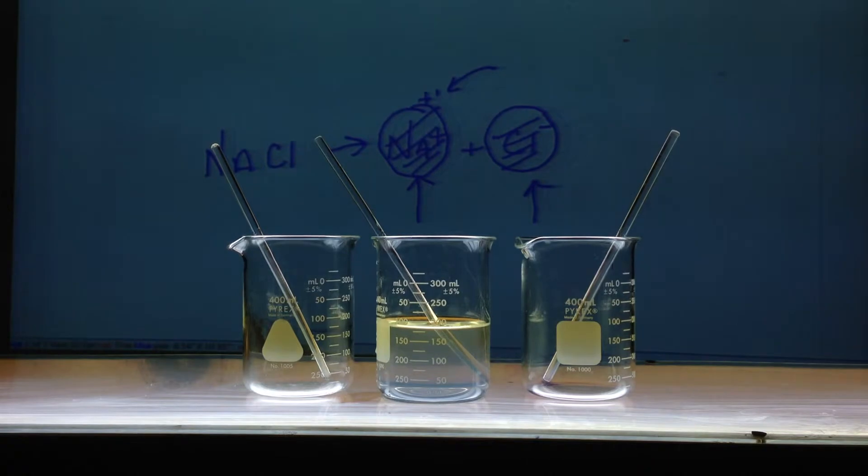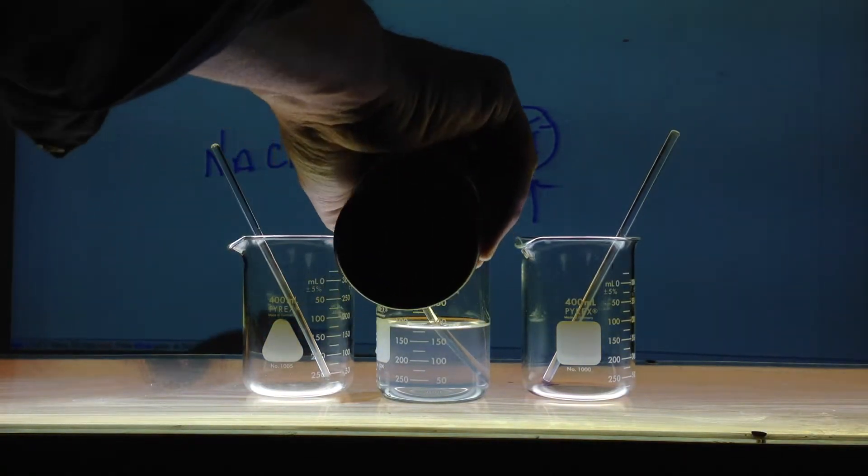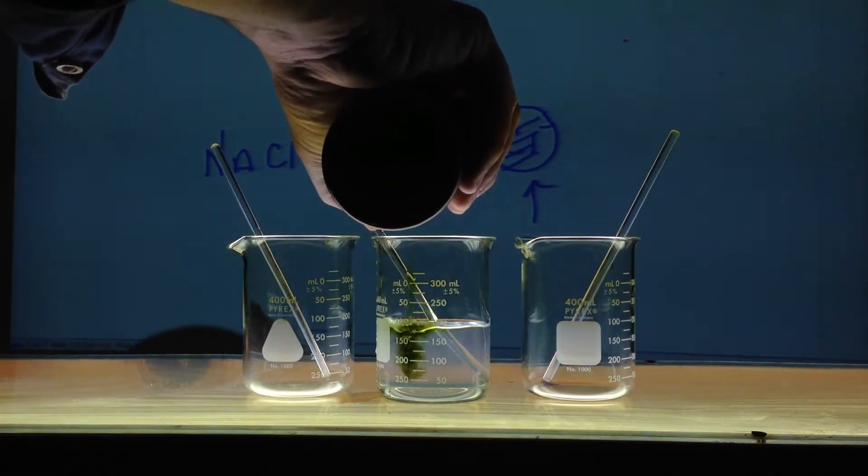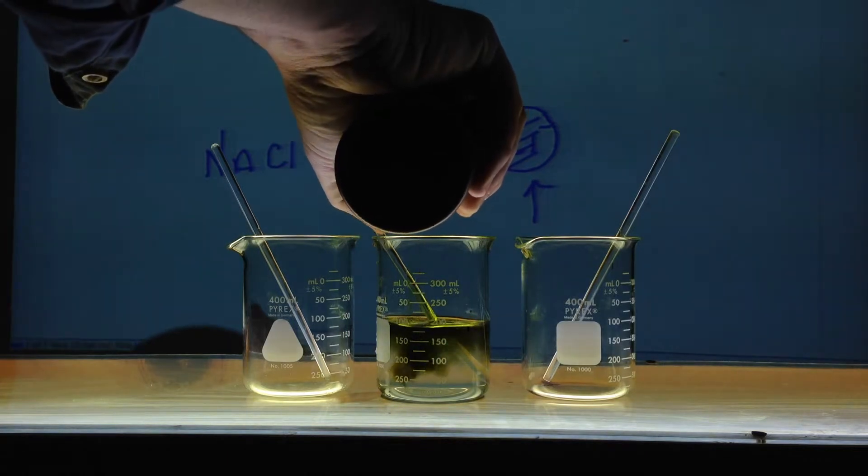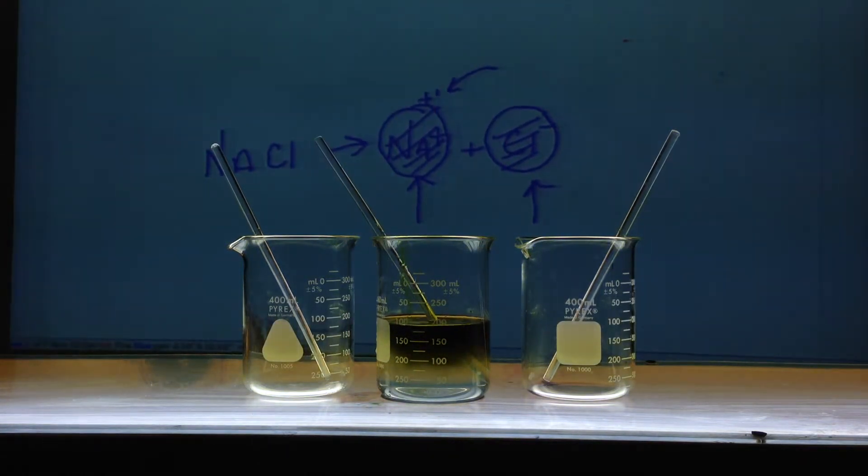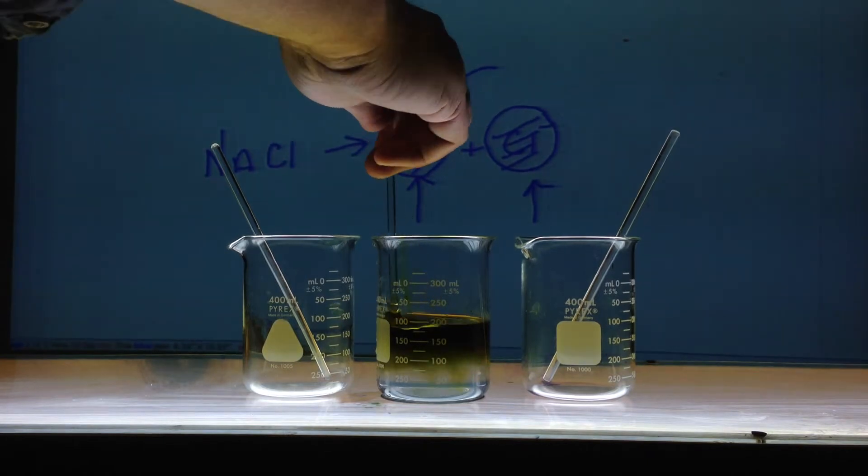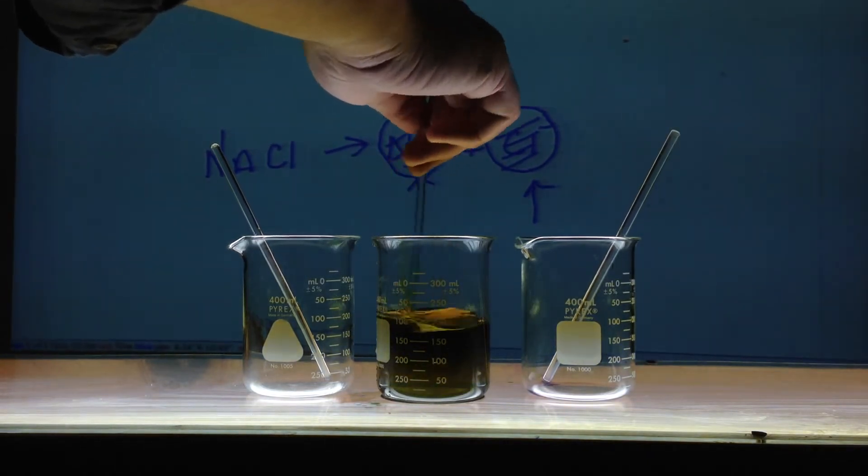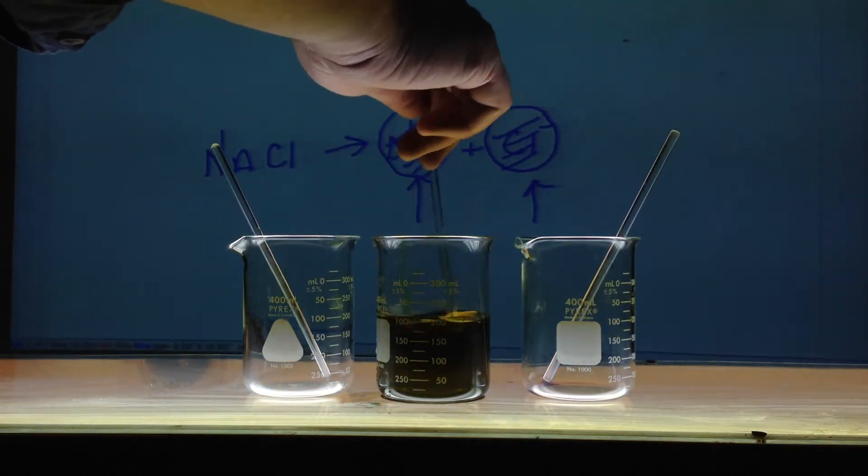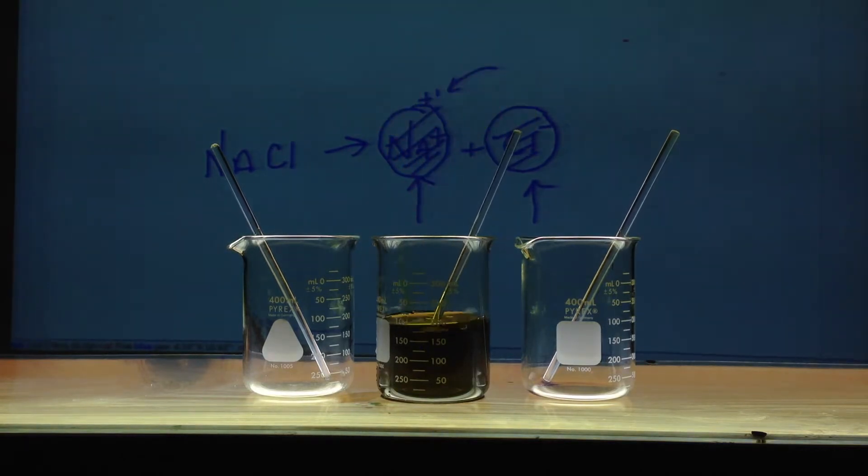So, this is a neutral salt because the conjugate base of a strong acid and a group 1 ion that is always soluble, that is spectating because it's too big, this should come out green. Let's add some universal indicator. And it gives me the greenish color. Because the bromothymol blue is yellow in the acidic range and blue in the basic, so I get this greenish color.